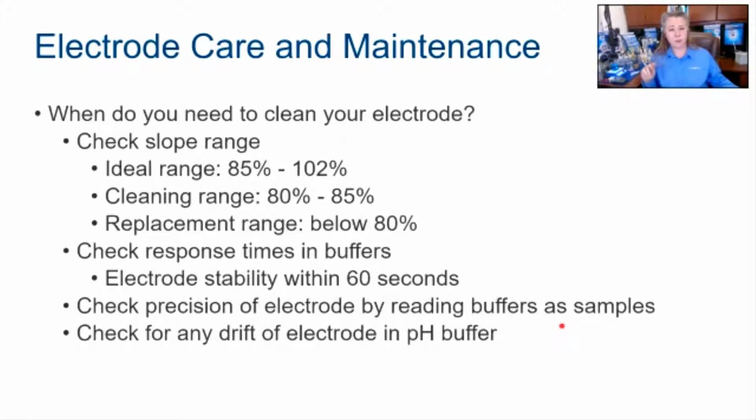Because if you just did a few measurements and you come back and it goes all the way back up to 97, that's fantastic. If it doesn't, that gives you an idea that there's something else going on. Maybe it's no longer any good. Once you have a clean probe, it was 97, it's 97 again, and you do the 4-7-4 example and you check your stability in the buffer and it does not come to that pH 4 in 60 seconds. In fact, it takes almost 10 minutes.